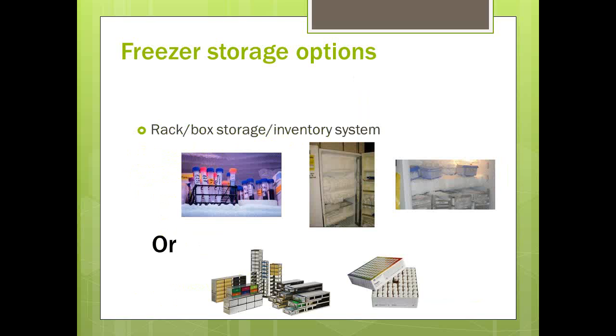Once you have a freezer, how are you going to store your samples? And here are some horror stories. This one isn't so bad, but typically you open most laboratory freezers with racks and stuff all over the place. Some things are labeled, some things are not. There are boxes, and people know, well, that's so-and-so's shelf. I don't know what's in there. Sometimes they look like this, not very useful, and other times they look like that. You really don't know what the heck's going on.